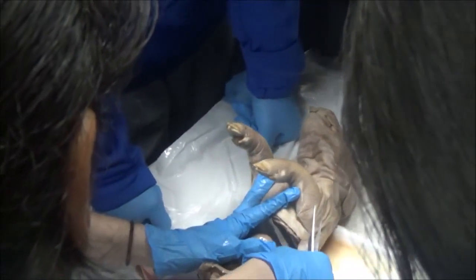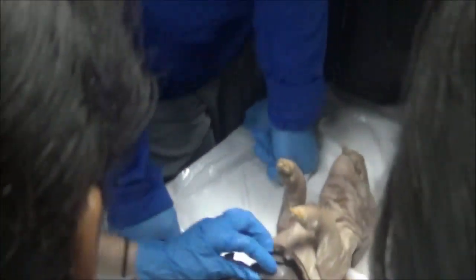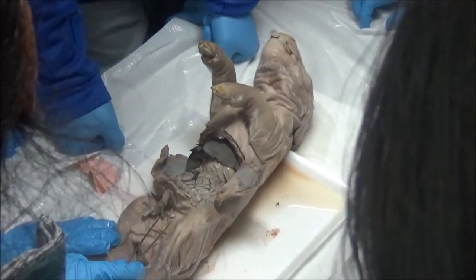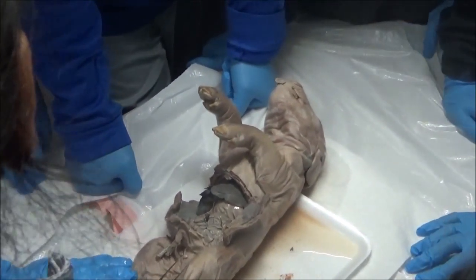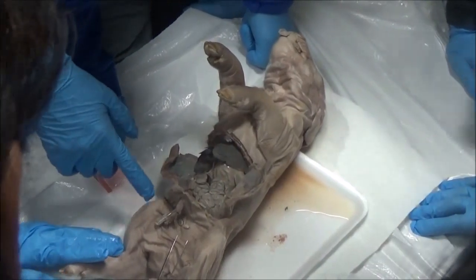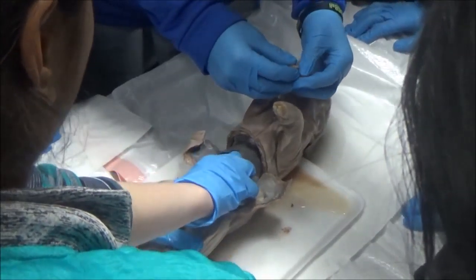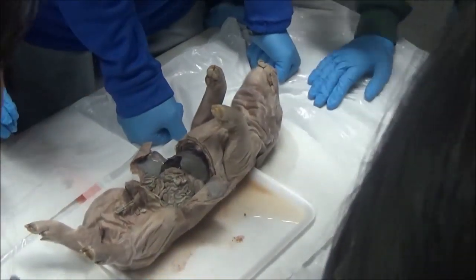If we were to open the stomach, it would smell horrible and it would be full of brown stuff. On the last day with this pig, you can open the stomach if you want. We're going to look at it for multiple days. If you tried to pull the stomach out, would that be possible? It's connected to everything — connected to the muscle.